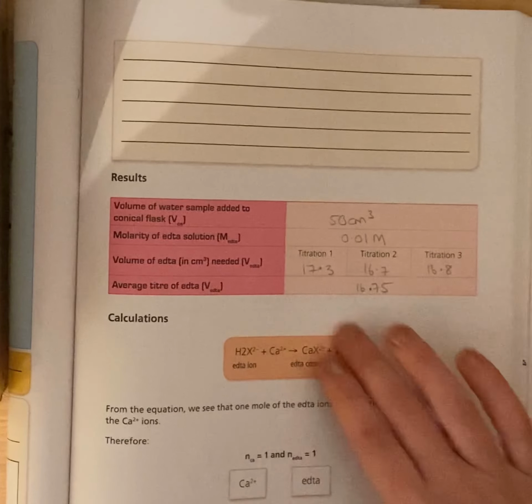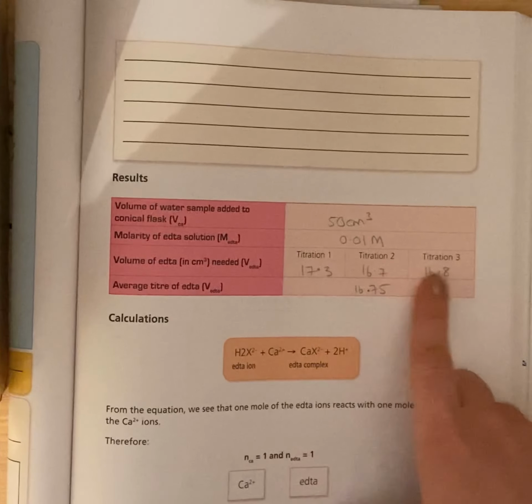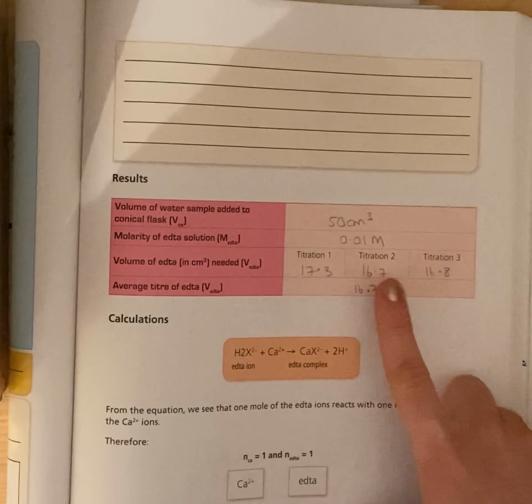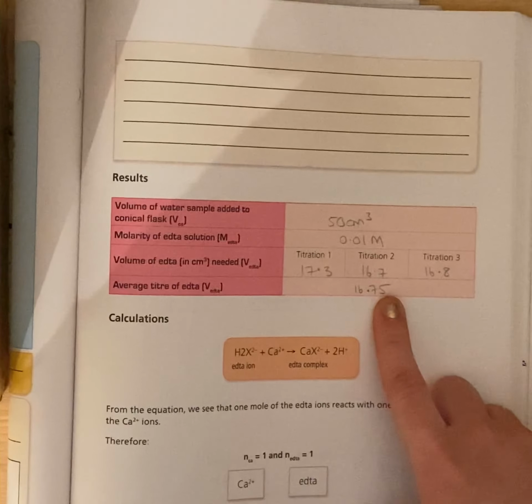You'll do your titration and you'll get roundabout figures like this. So hopefully one rough, two are more accurate and closer together by a difference of 0.1 centimeters cubed. Whichever your two titrations are closest, take them, add them, divide by 2, and you'll get your average titer that we're going to use for our calculations.